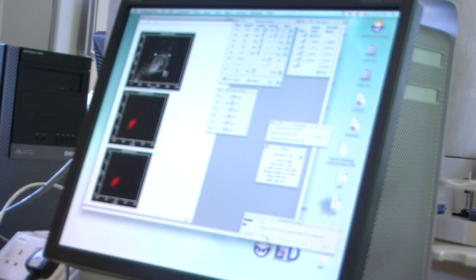This is our fluorescence images that we will be doing next week. But the labelling process for microscopy is pretty much the same. You could, in theory, take these tubes, put some of it on a slide and look down. What you don't see, though, is morphology. Because they've been taken off their substrate, they're all rounded up. So they won't be spread out like a growing cell will.